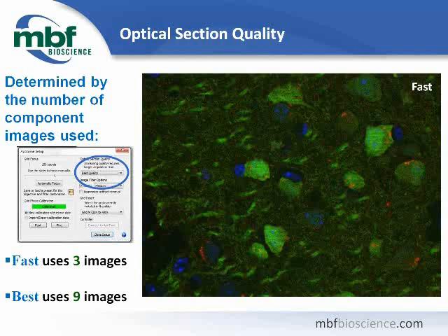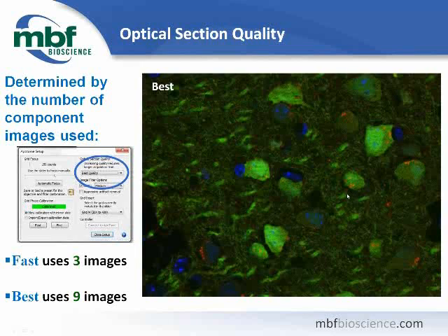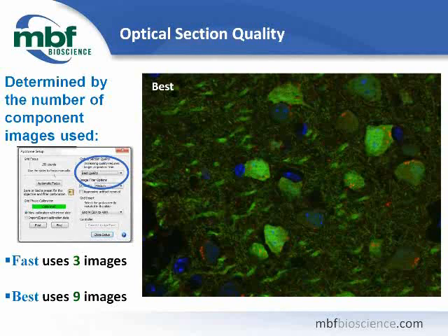The Fast Acquire uses three component images. Each increment in quality setting adds more component images to the final optical section. The Best Quality uses nine images. Here is an example of an image captured with Fast Acquire — it's a little bit grainy. So we change to Best Quality Optical Section and re-acquire, getting a much smoother, bright image with improved quality. The trade-off is longer acquisition time — in this case three times as long, gathering nine component images rather than three.